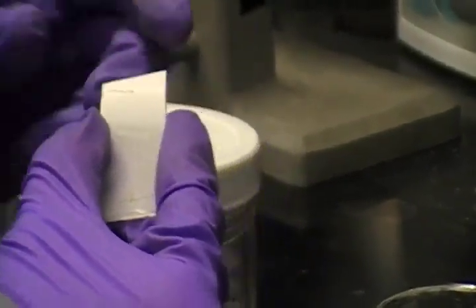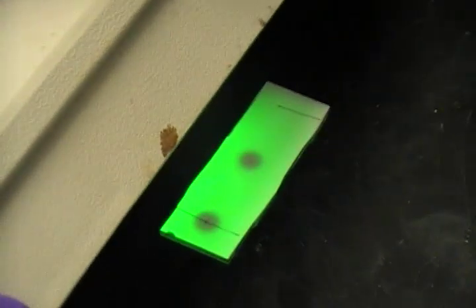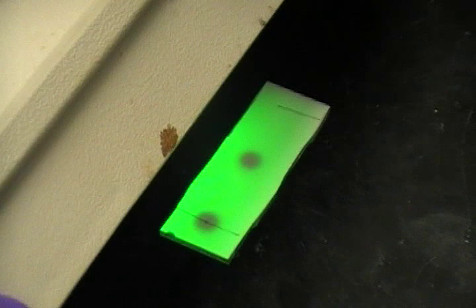Not all compounds on the plate will be visible by the naked eye, but we can visualize them if we put the TLC plate under a UV light. As you can see, the non-polar compound is higher up on the plate with the larger RF. The polar compound is on the baseline where it was originally spotted.